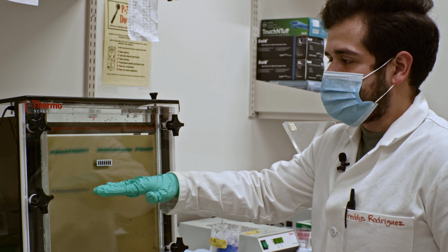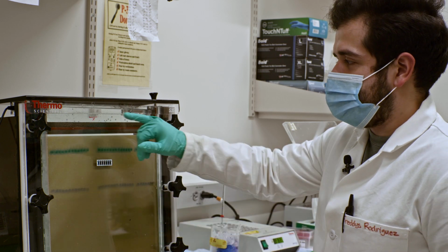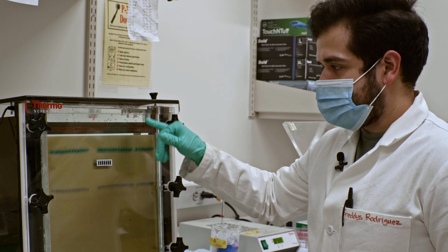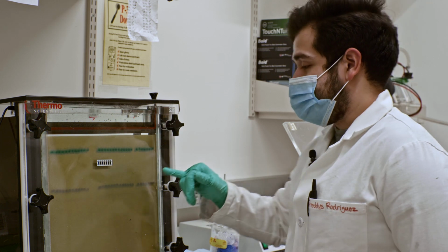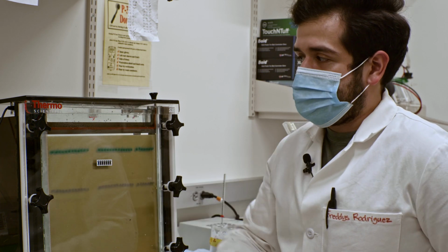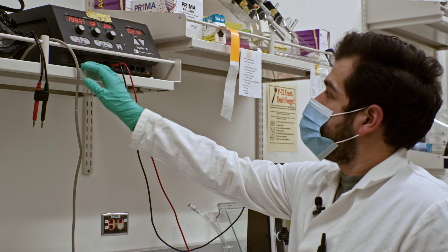What we'll want to do now is to deconstruct this whole gel apparatus. We'll have to drain out the TBE from the top compartment into a flask. But before that, we also have to turn off the generator in order to not electrocute yourself. Then after that, we'll get the gel out and pop open the glass plates in order to then image the gel. First, we're going to cut off the power.